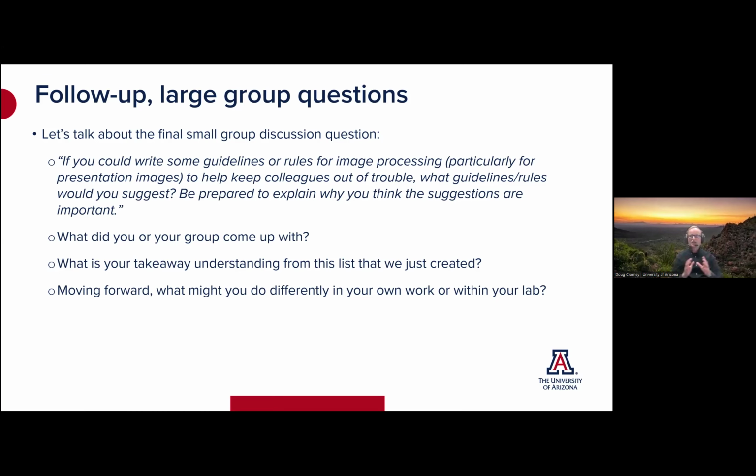And just watch when you downsize images to make them fit on a page, or perhaps decide that you want to blow something up. You'll find you don't add any more resolvable data by making an image larger.